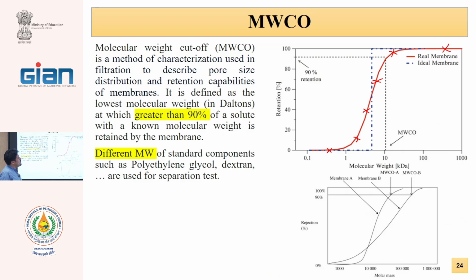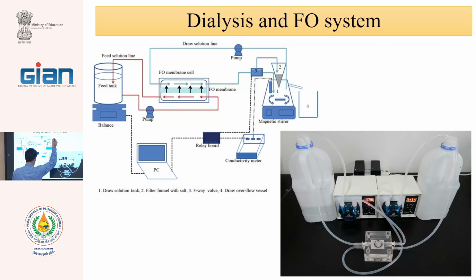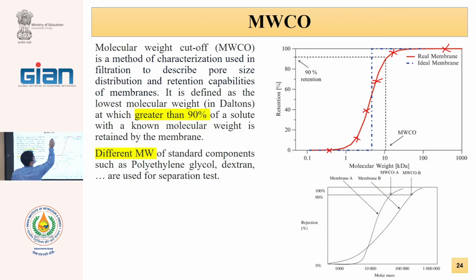For measuring of the molecular weight, we see that the points can reject 90%. Therefore, after drawing this diagram in Excel, we draw this line to cut the diagram and go back to this one. And this place will be our molecular weight cutoff.